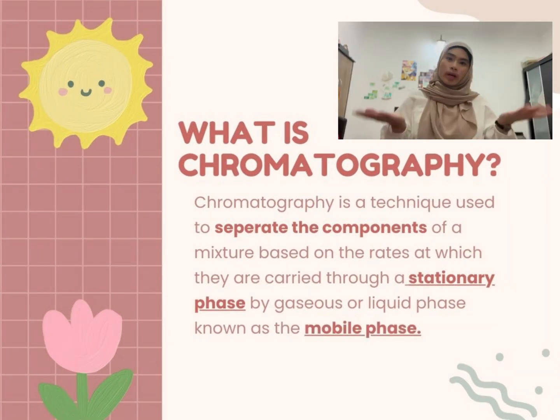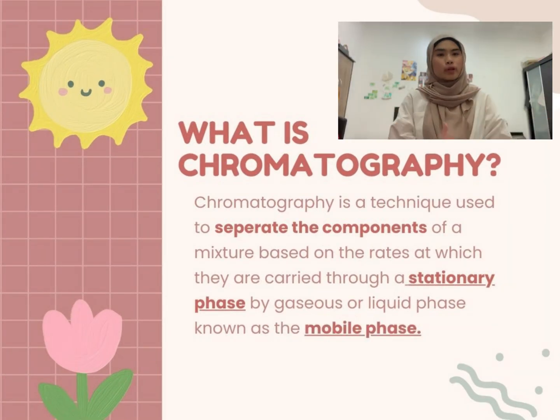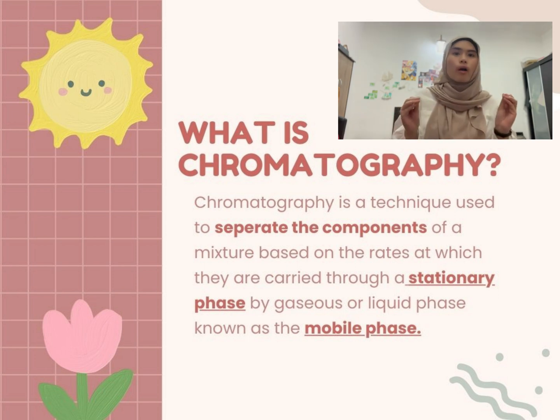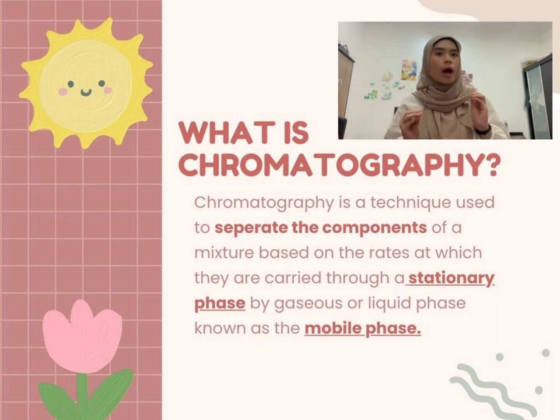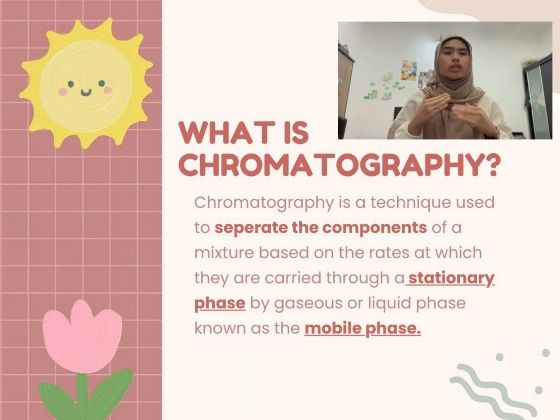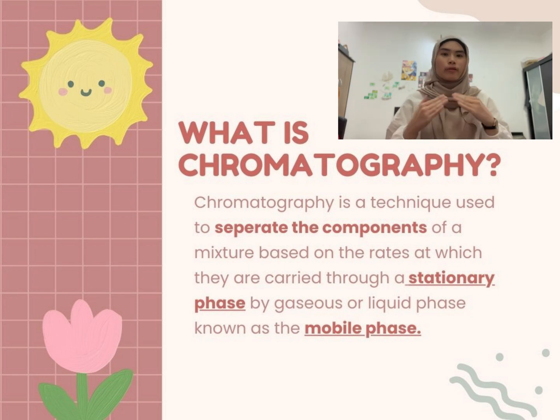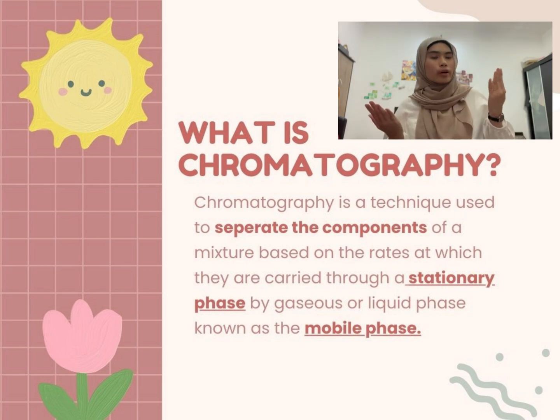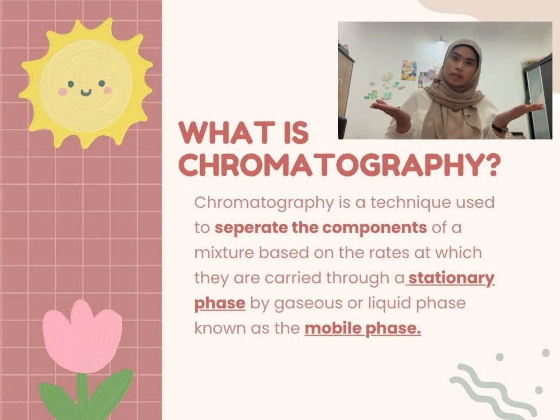What is chromatography? Chromatography is a technique used to separate components of a mixture based on the rates at which they are carried through a stationary phase by a gaseous or liquid phase, known as the mobile phase.